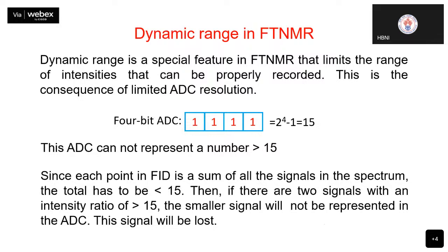Okay, the binary. Let us consider that you have a 4-bit analog to digital converter. Now, how do you understand what the binary number is? If I have a 4-bit ADC and I fill all of them, in each of these there can be only 2 numbers, 0 or 1. Binary means either 0 or 1. Only 2 possibilities are there. If it is 0, it is empty. If it is 1, it is full. So let us assume that it is a 4-bit ADC and it is full, and all the 4 bits are 1111. So what is the number which it represents?